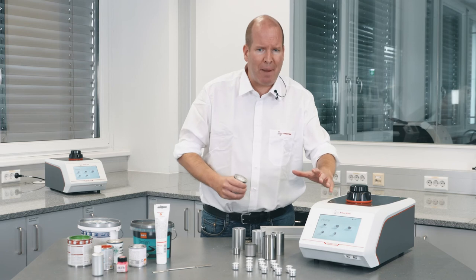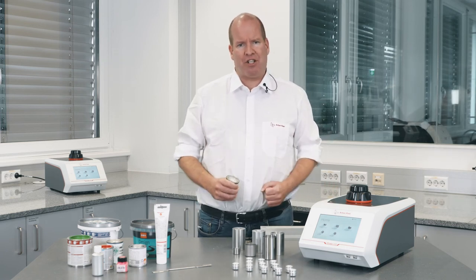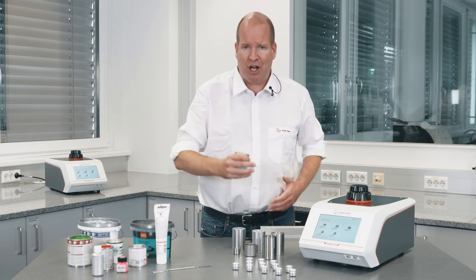Choose the Ultrapyc 5000 density analyzer — achieve batch-to-batch consistency and fulfill all regulatory packaging requirements.